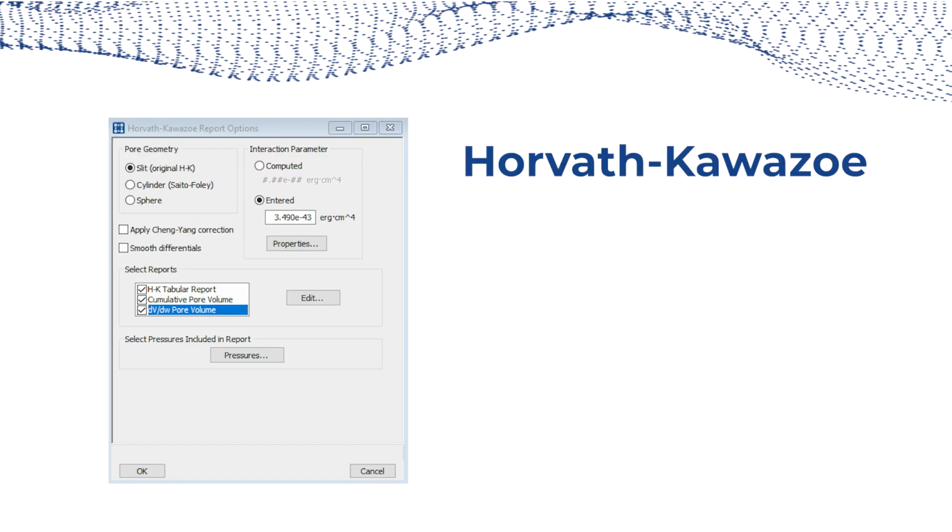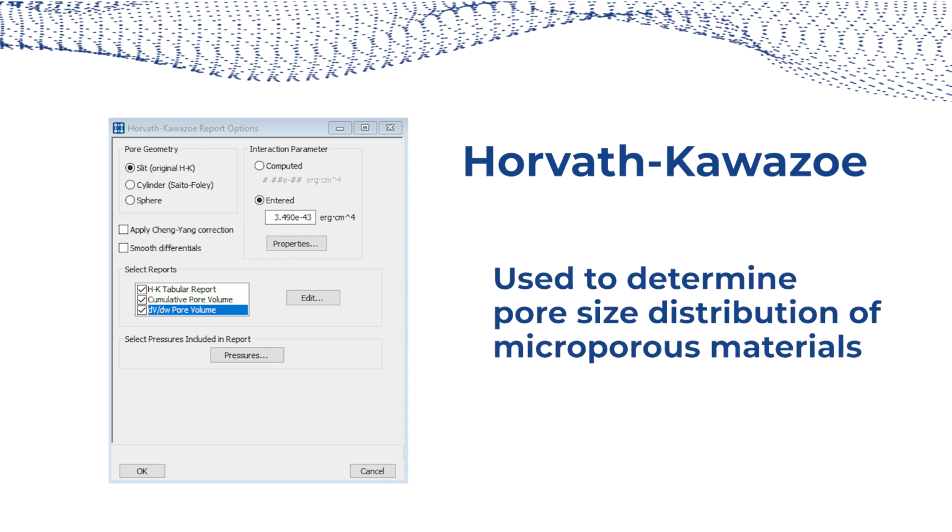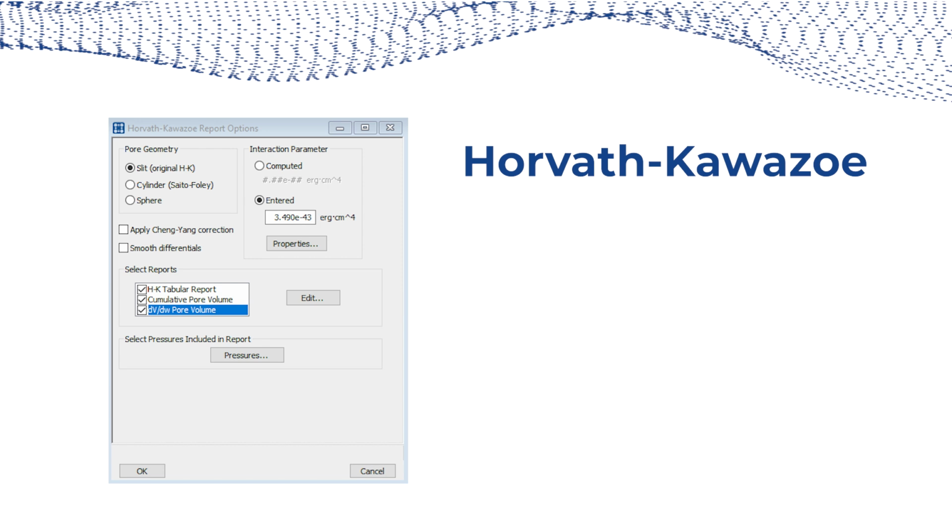The next report is the Horvath-Kawazoe report, commonly referred to as HK. HK is very complementary to BJH because it looks specifically at microporous materials, whereas BJH will consider the larger pores for mesoporous. The first thing you need to select in the HK report is a pore geometry. There are 3 options available: slit, cylinder, and sphere.